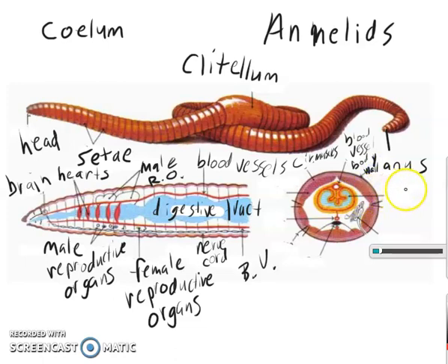Okay. Then up next we have a digestive tube. These are also part of the digestive tube, it looks like. This part here is the nephridia. And nephridia are similar to flame cells. We learned about flame cells in other organisms. The flame cells help to remove waste.